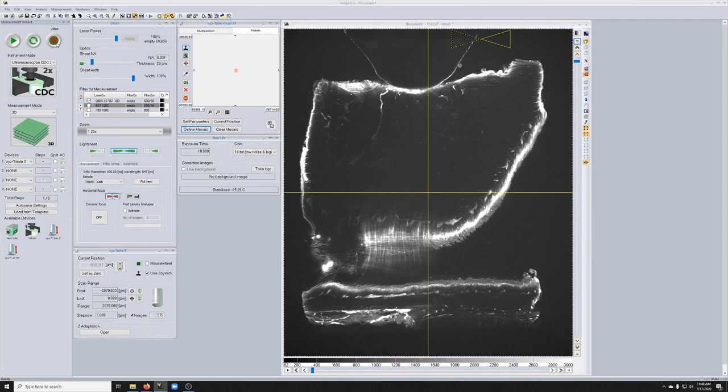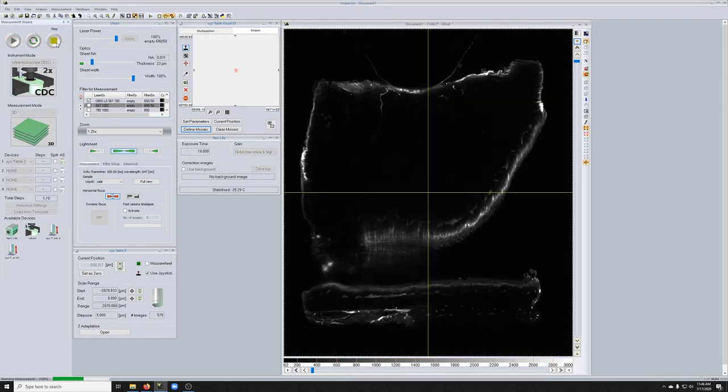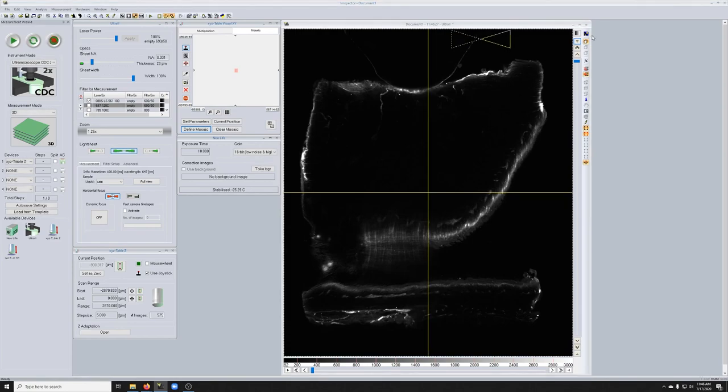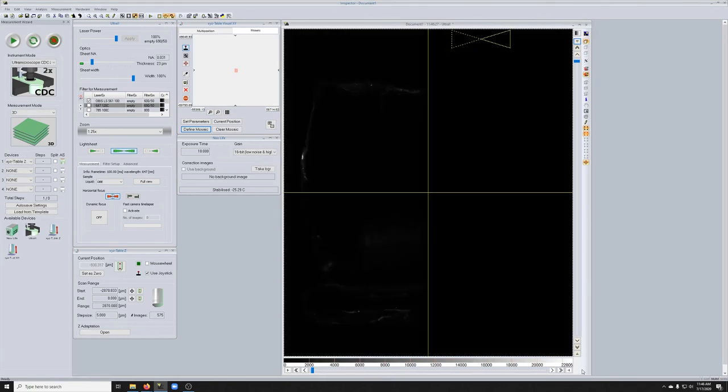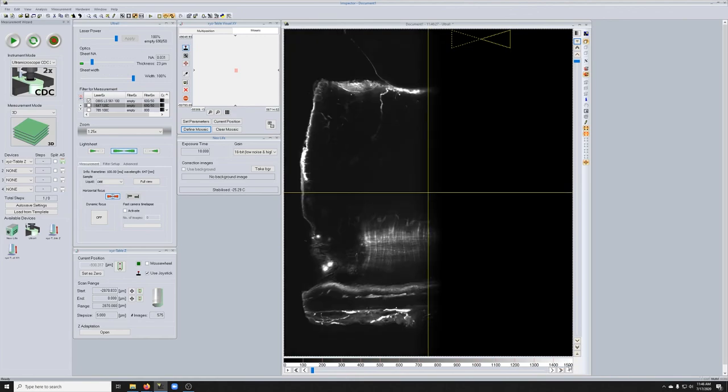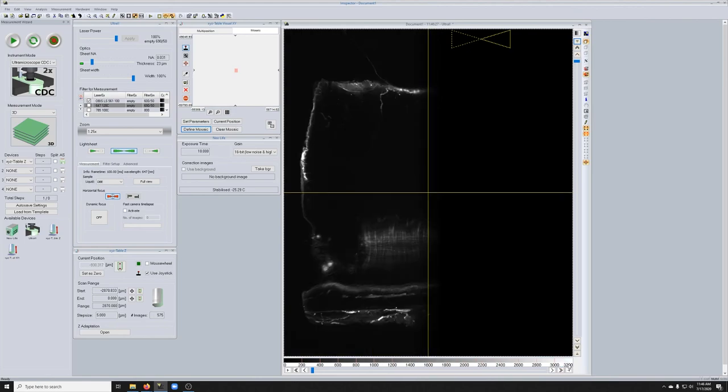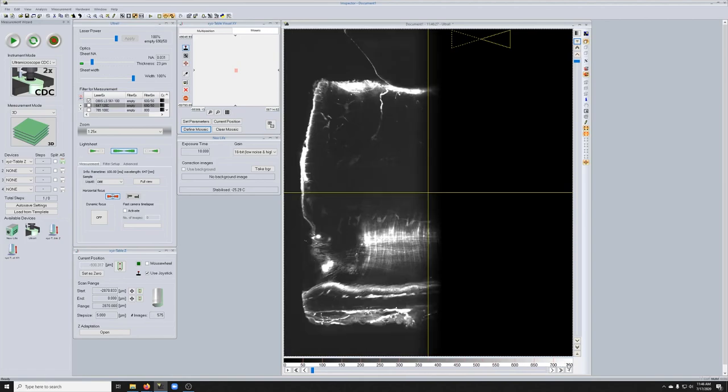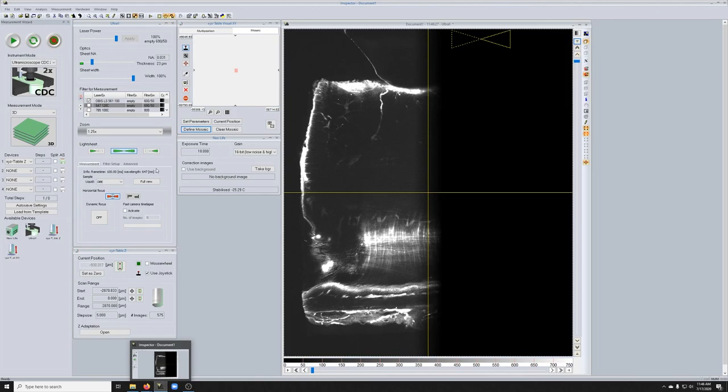Now, I'm going to show you very briefly that this is true. Unfortunately, I didn't give it enough time to do both sides. But you can see that the quality is quite good. Just basically trust the graph that the quality is going to be the same if you have the same total amount of laser power.